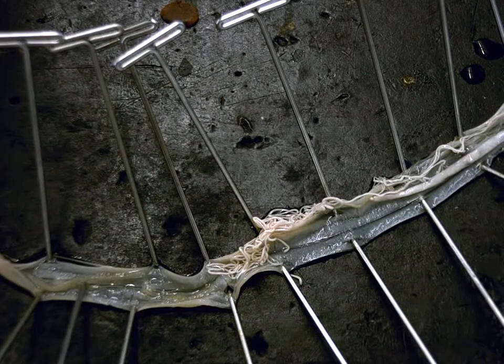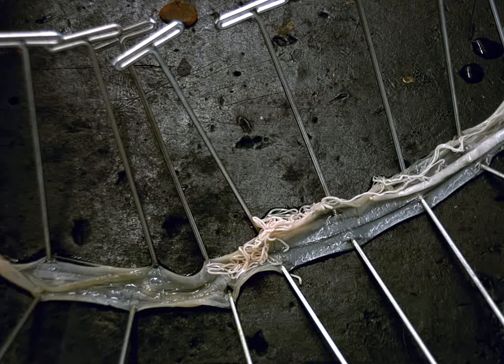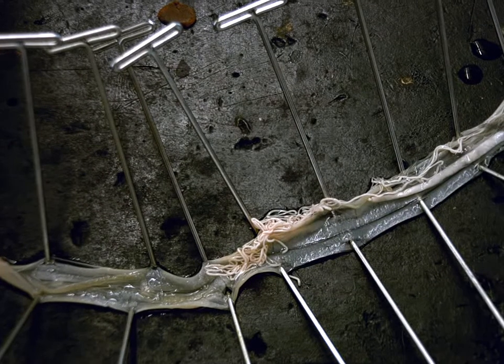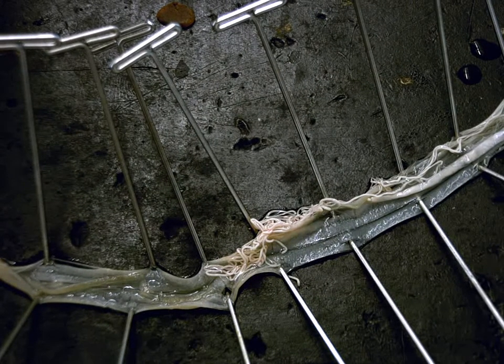So up here we can see a yellowish kind of flat tube, and this tube continues all the way down the worm. And that would be the intestine.